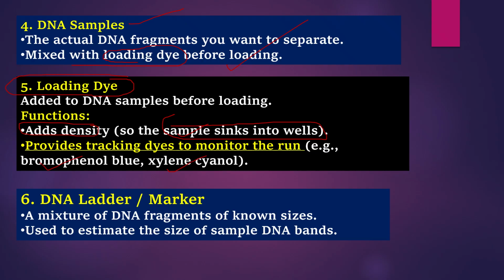It will provide the tracking dye to monitor the run, meaning where our DNA molecules have reached, or whether our gel is running or not. For tracking and monitoring that, we have to add a tracking dye or loading dye called bromophenol blue generally, and xylene cyanol.